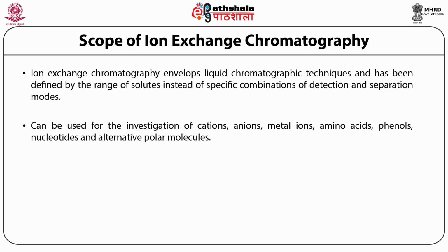Immense relevance, including average cost, tremendous performance, influential resolving ability, huge sample handling capacity, and easy scale up along with automation, has made ion exchange chromatography one of the most significant and broadly used among all liquid chromatographic techniques.